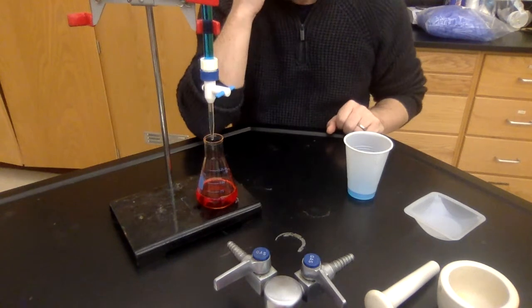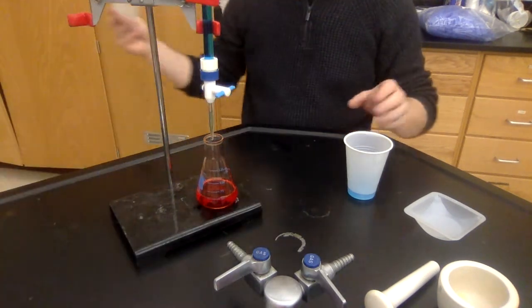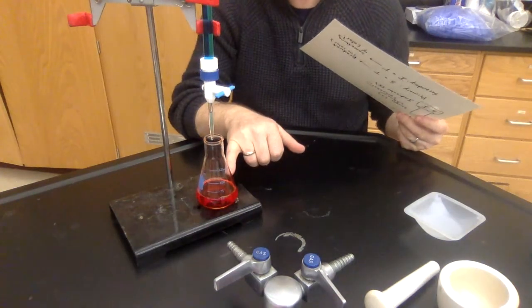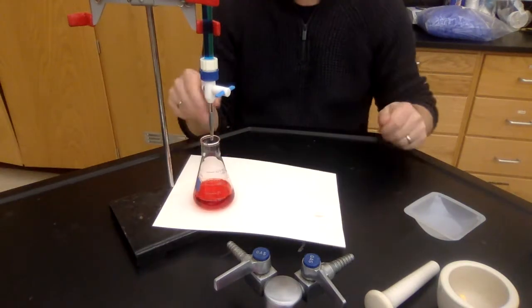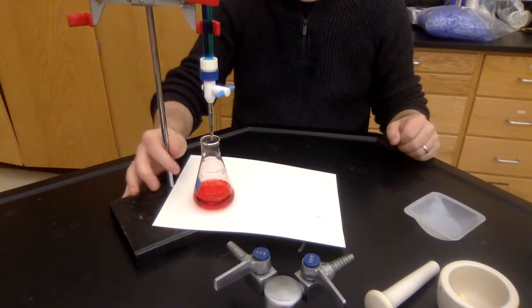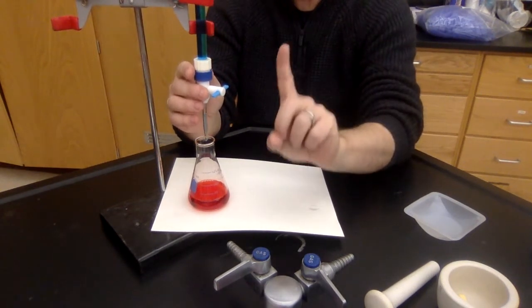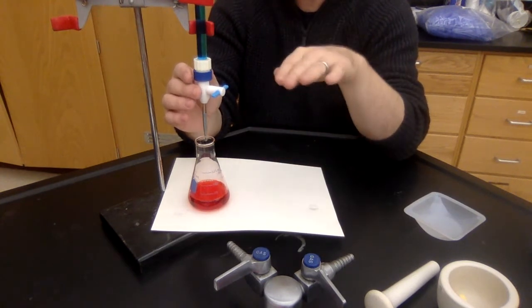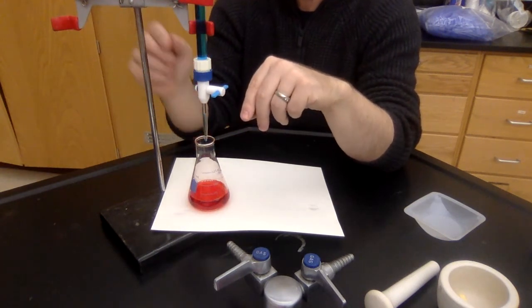All right, now the other thing that you need to do though is you never want to be trying to look for a color change. So your solution is going to be clear and you're looking for a dark blue-black change. So you want to put something under it so that you can see it well. All right. Now, somebody's going to take the measurement up above of the initial quantity. Your eyes should be at the level of the burette so that you can get a good measurement.